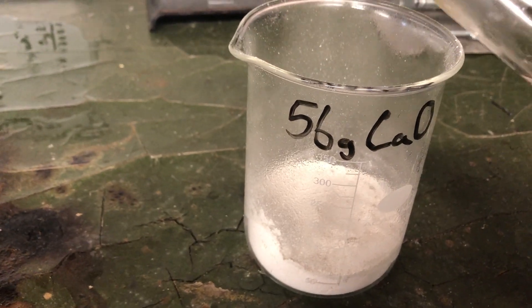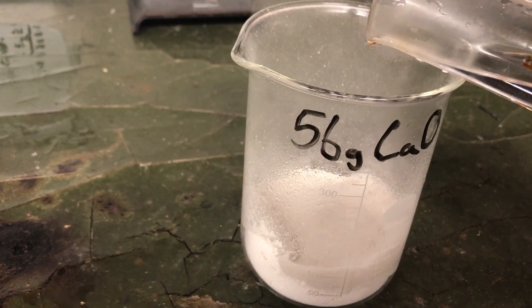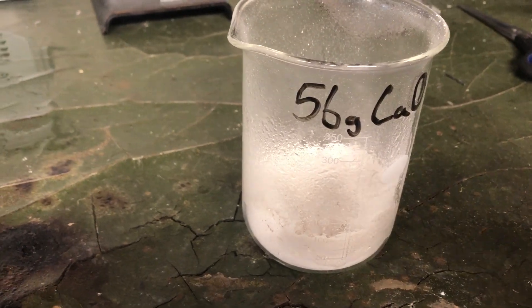Barely added any. Incredibly violent reaction.